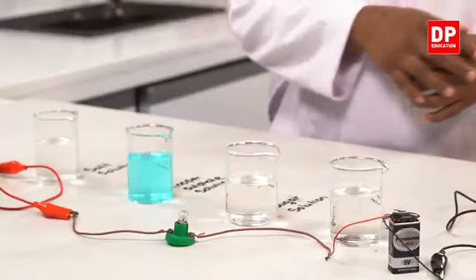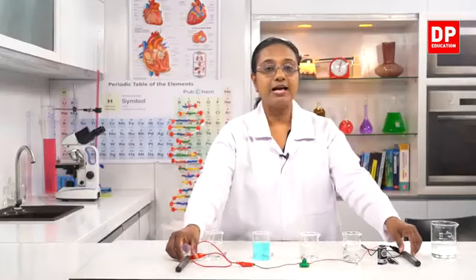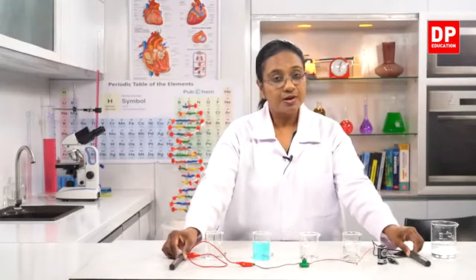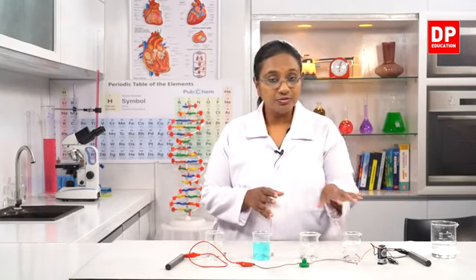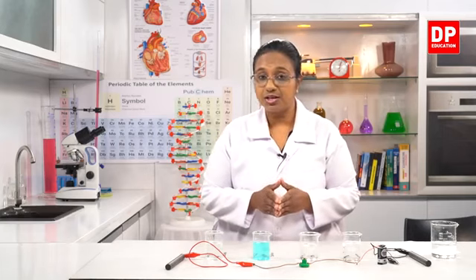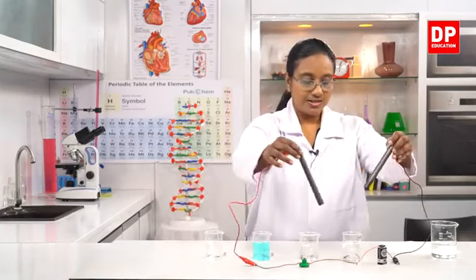So you can see that's a 9-volt battery, a small bulb is connected, and here I have 2 carbon graphite electrodes. So what I'll be doing is I'll be inserting the electrodes into the different solutions. You will have to observe what happens to the light bulb. So first we will start with distilled water.